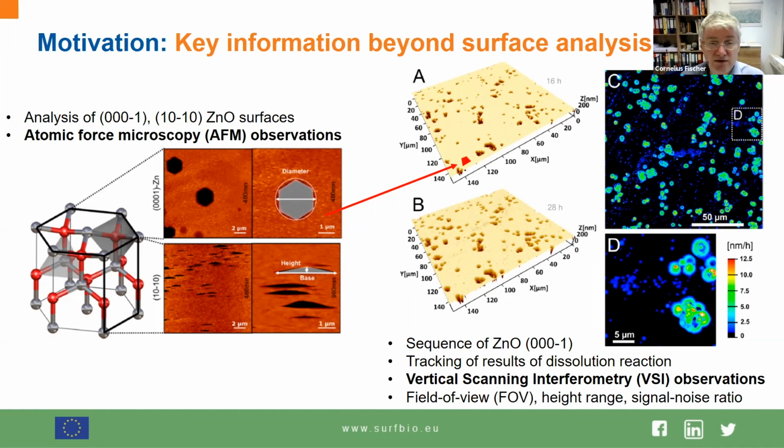Nevertheless, there are at least two to three major differences compared to AFM. For field of view, it's really big. That's the minimum field of view size. It's about 100 by 100 micrometers and can be enlarged up to the millimeter range.